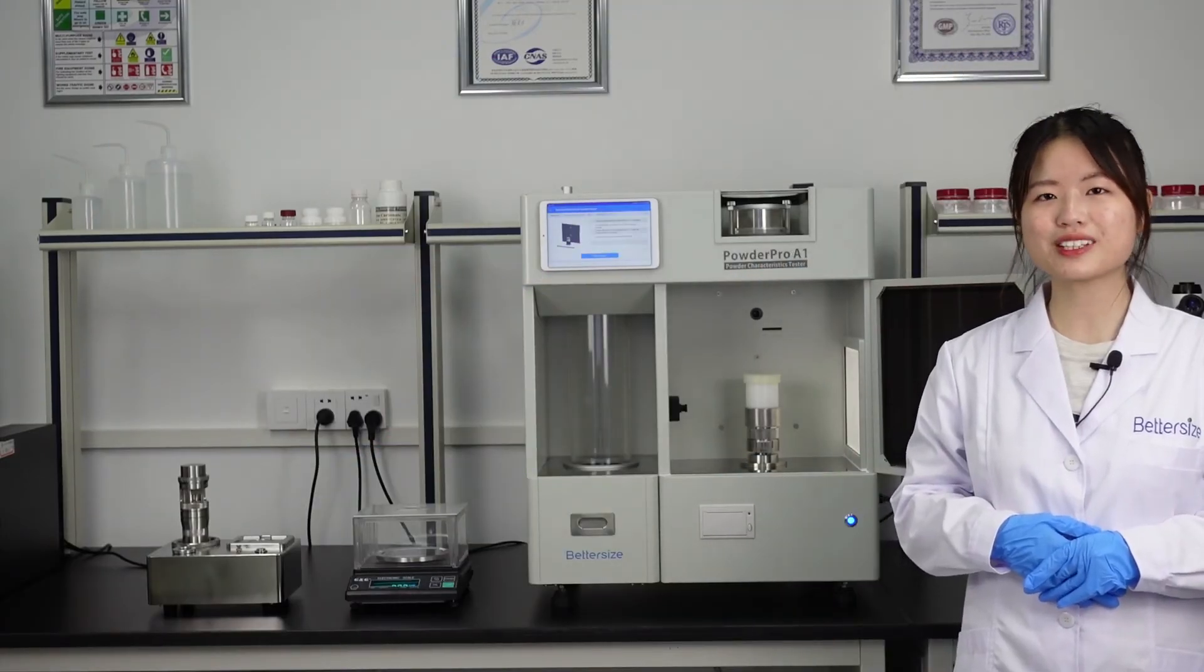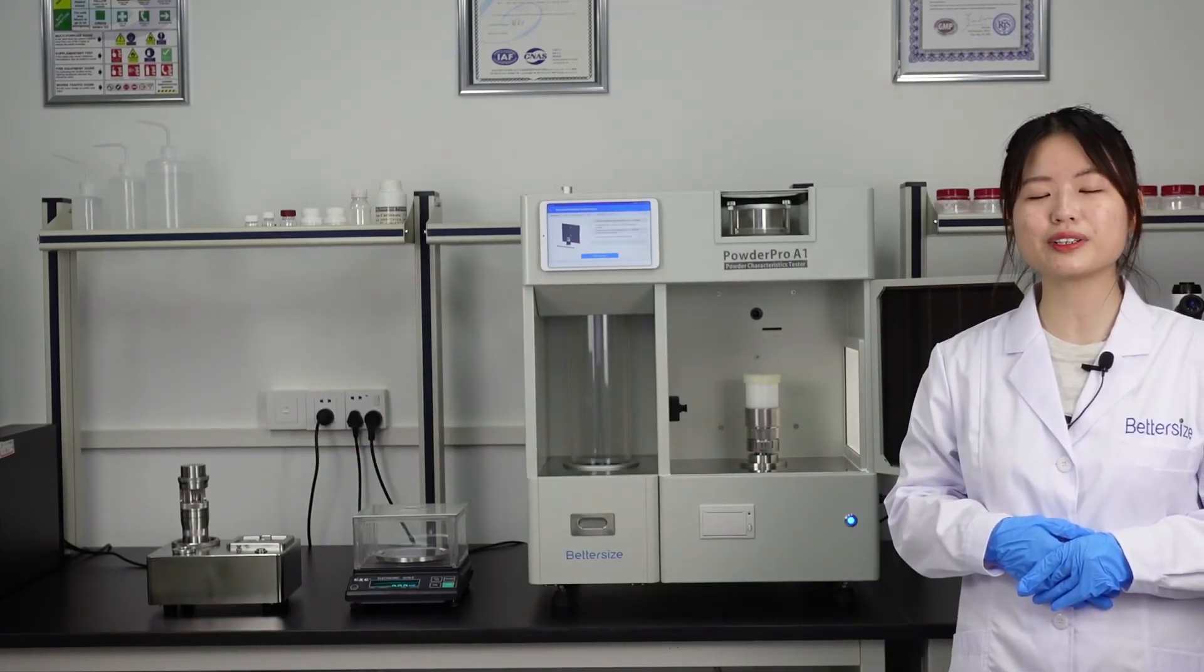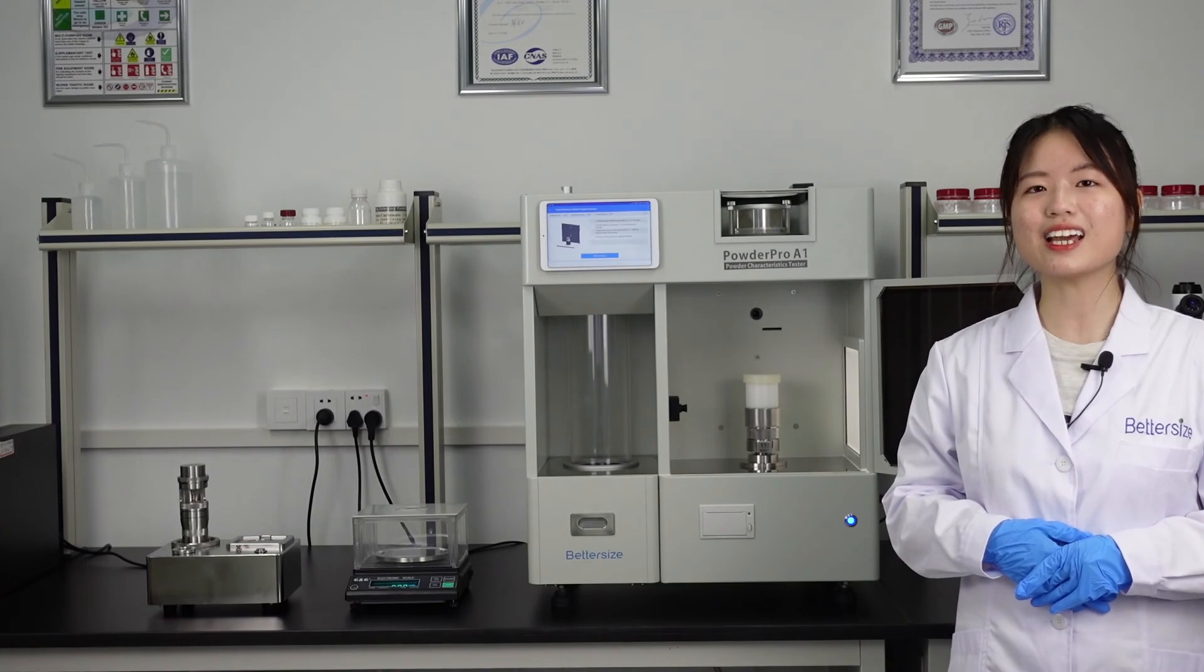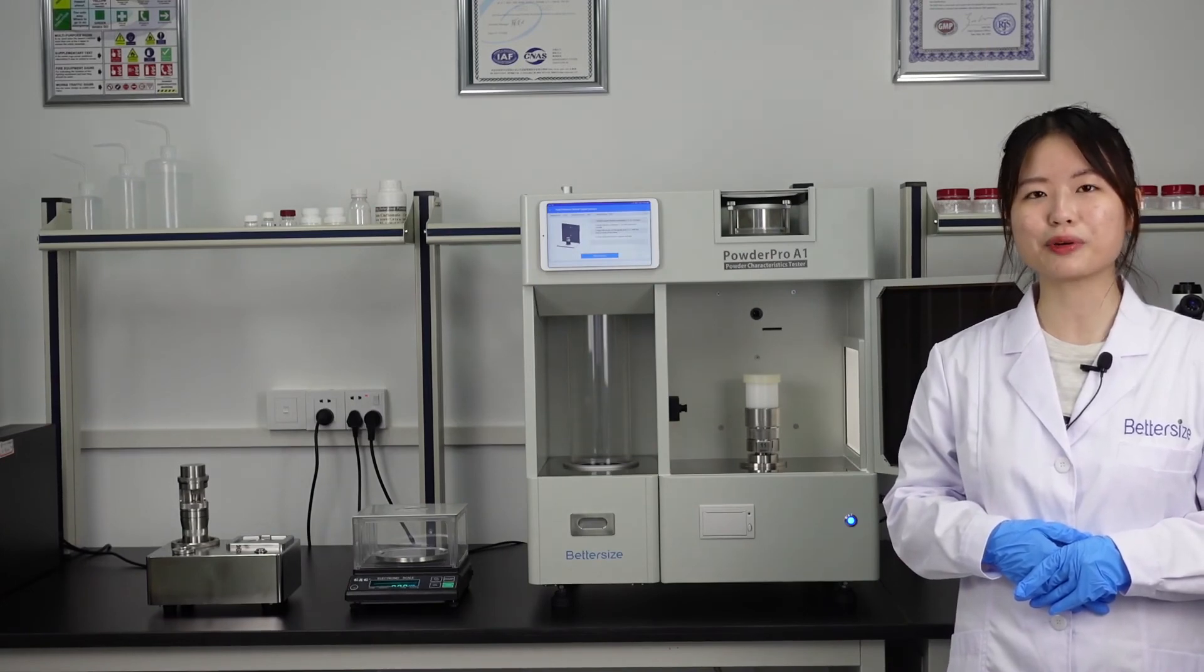So far, we have posted a series of videos including the measurements of angle of repose, angle of fall, angle of spatula, and bulk density and tap density using the PowderPro A1.